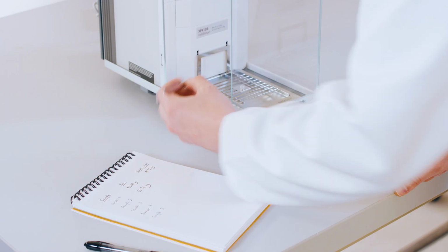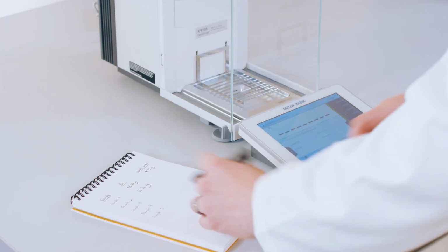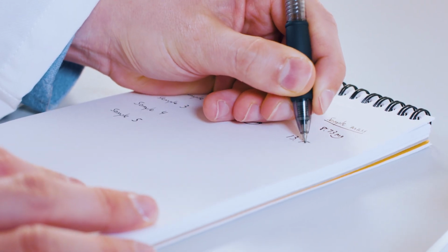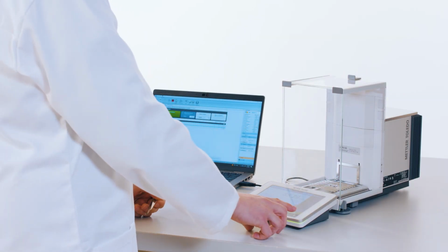Today I'll be giving an overview of the new TRIOS EasyMass feature for the Discovery DSC, which allows you to automatically send mass data from your balance directly to TRIOS. Until today, the DSC sample preparation process has involved weighing your pans and samples, writing down those values on paper, and then rewriting those masses into the instrument software to set up your experiment. With TRIOS EasyMass, pen and paper is eliminated from the process.